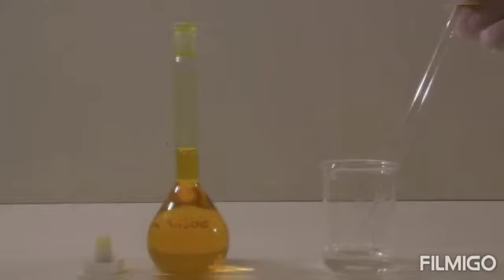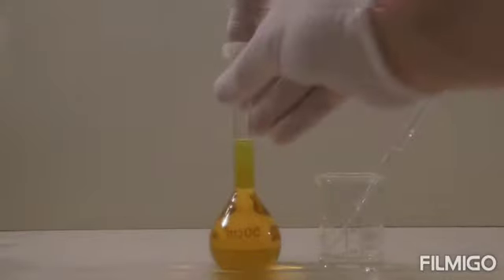After the uniform mixing, make up the final volume up to 50 ml, up to the mark, and keep this solution aside.